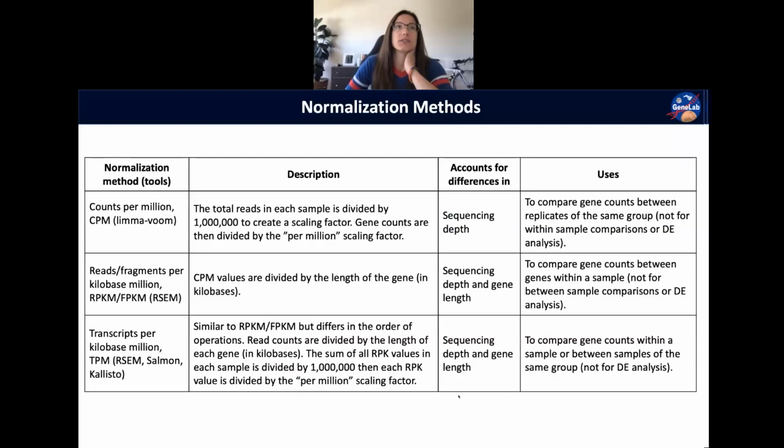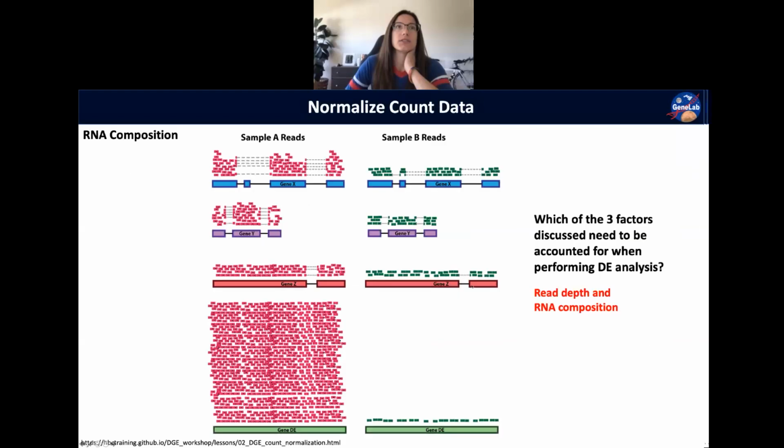Okay, how do we know the composition for the RNA? Good question, Rashi, good question. Unless we know which sequences are contaminants, that would probably be difficult to determine. And so different tools, independent of knowing what the contaminant is, will use different ways to normalize based on read depth rather than just taking the total number of reads.